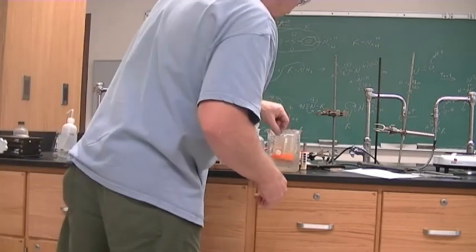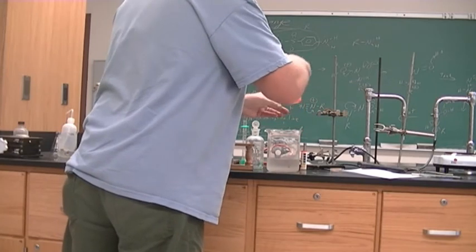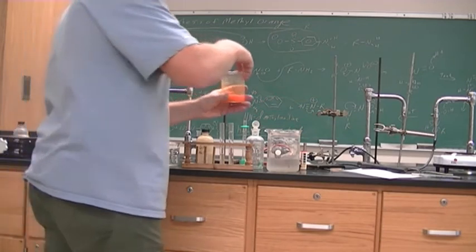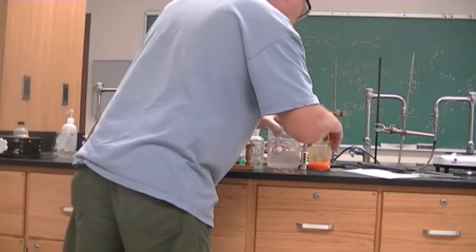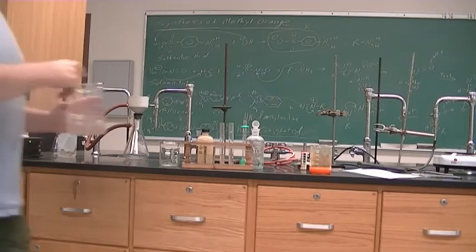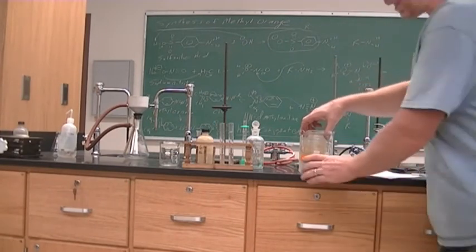So, need some more ice. All the ice melted. I want to make sure that this is precipitated out completely.